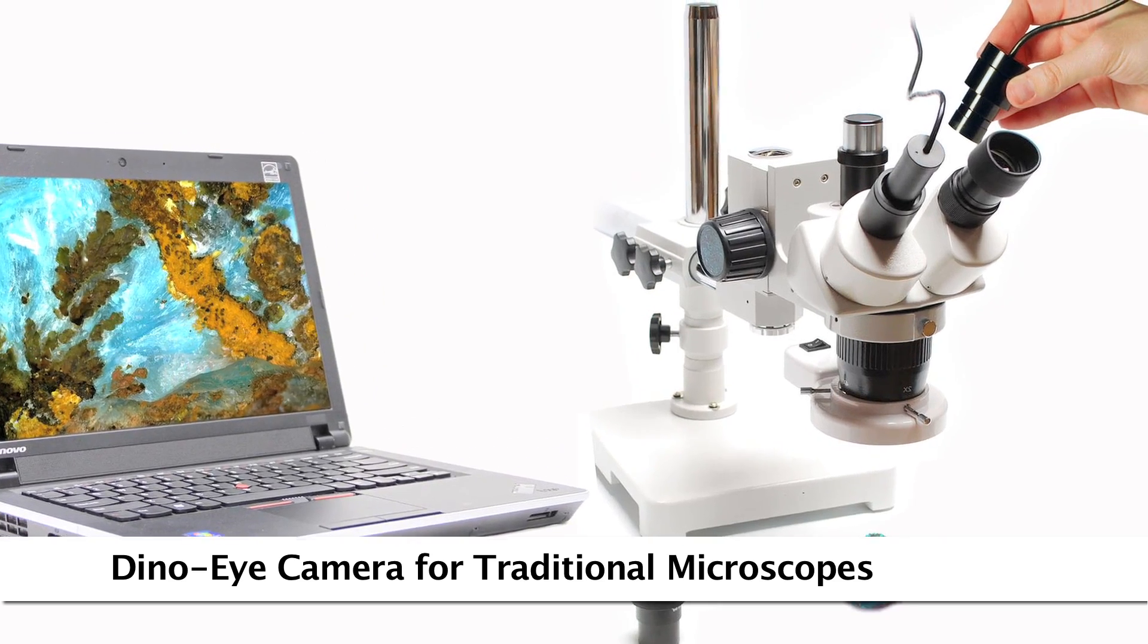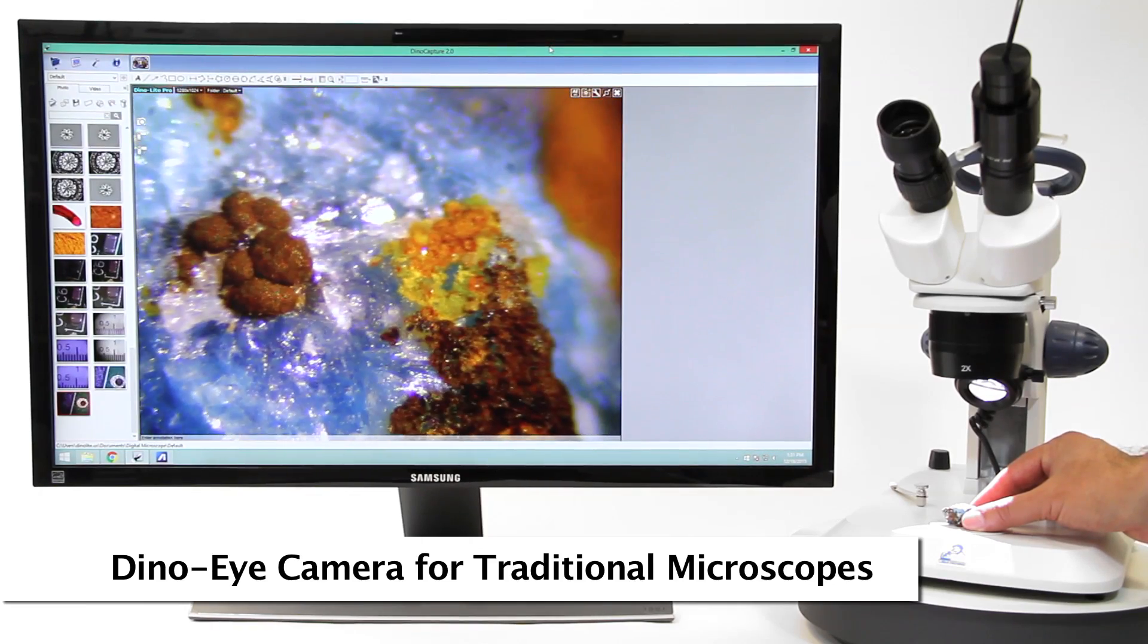Convert an existing traditional microscope to digital by replacing the eyepiece with a Dyno Eye eyepiece camera.